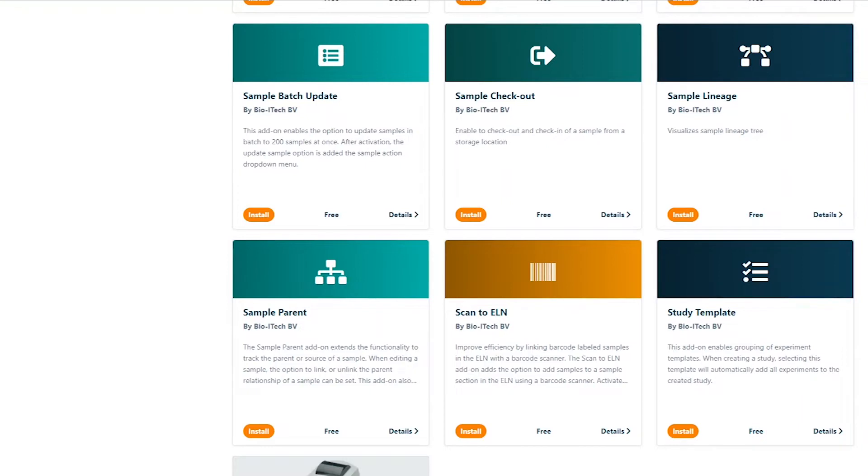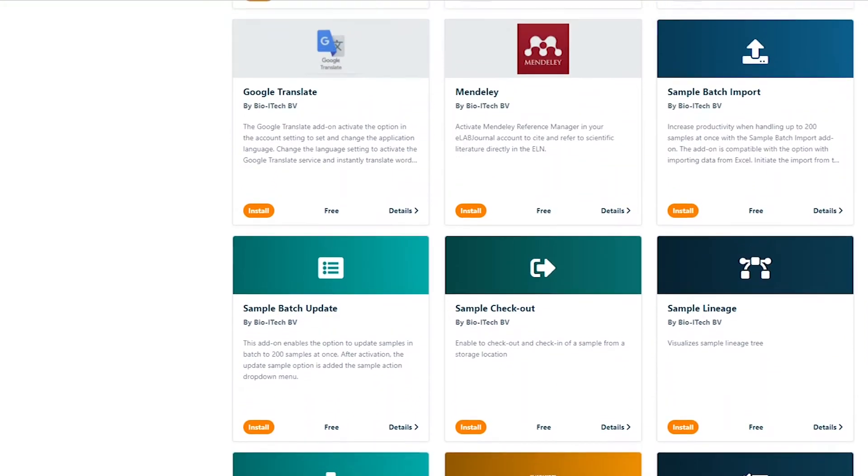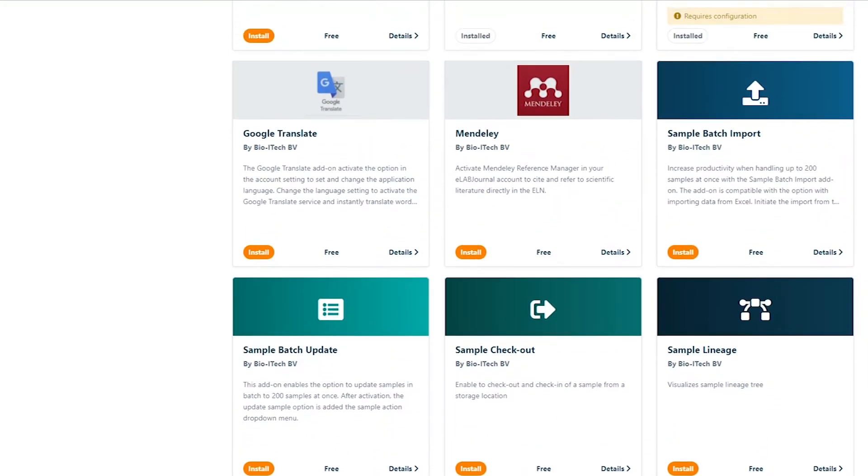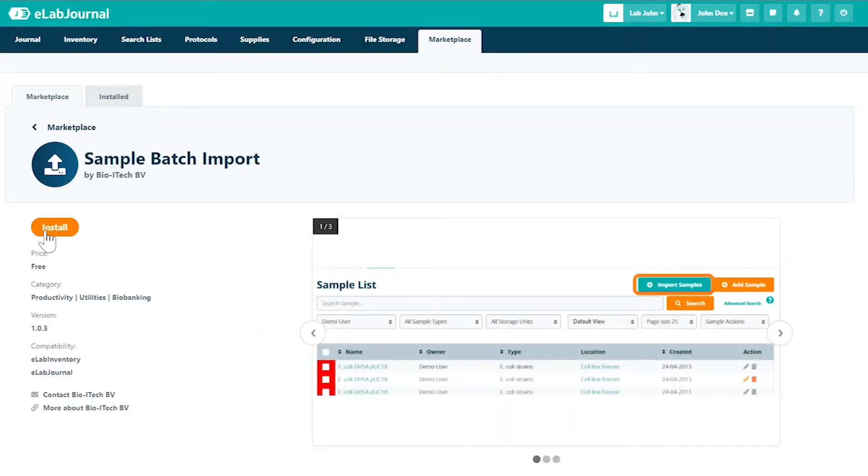For example, select an add-on to install such as Sample Batch Import. On this page, you'll find more information on the add-on price, version, compatibility, and user interface.